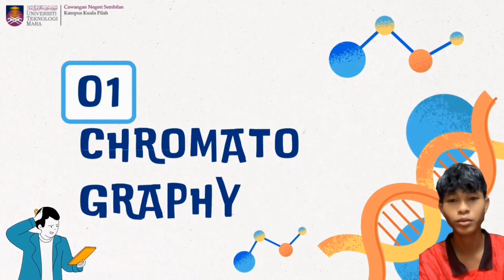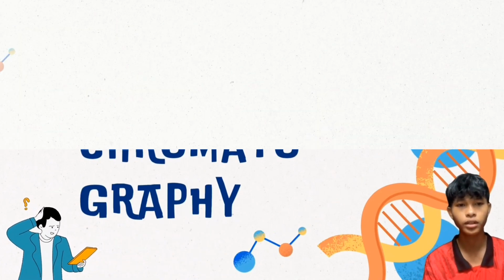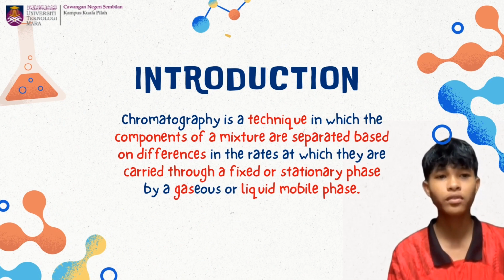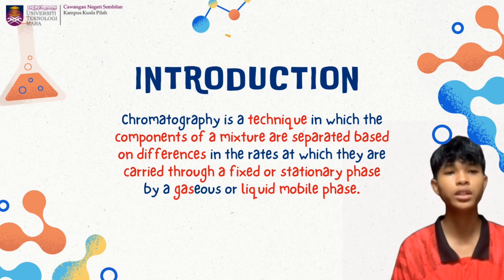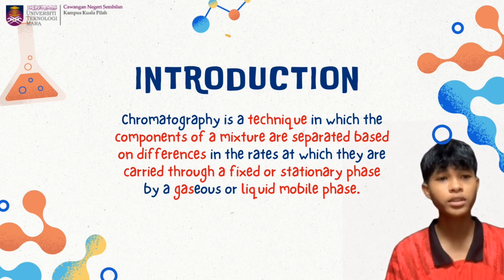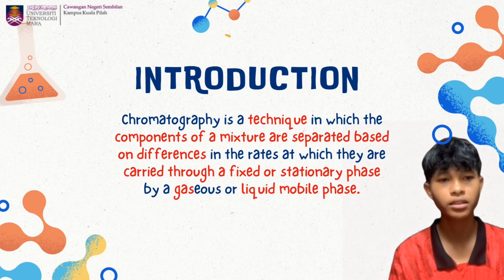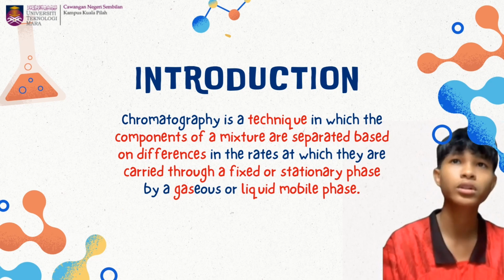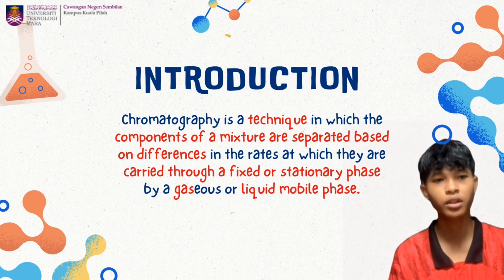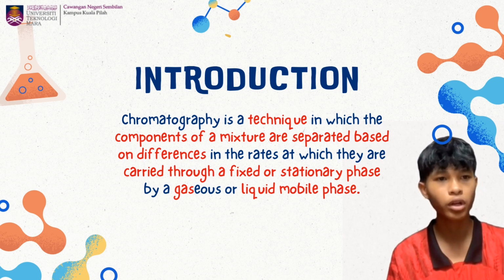Okay, Assalamualaikum. Today I'm going to explain about chromatography. I'm going to explain the introduction first. Chromatography is a technique in which the components of a mixture are separated based on differences in the rate at which they are carried through a fixed or stationary phase by a gaseous or liquid mobile phase. As we know, there are two types of phase, stationary phase and mobile phase. I will explain it later.